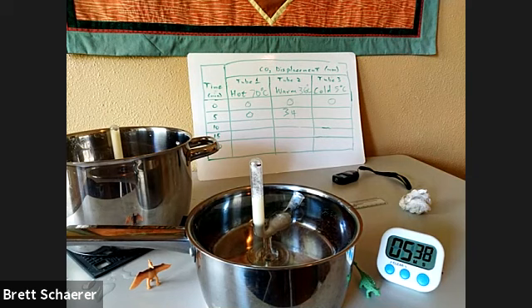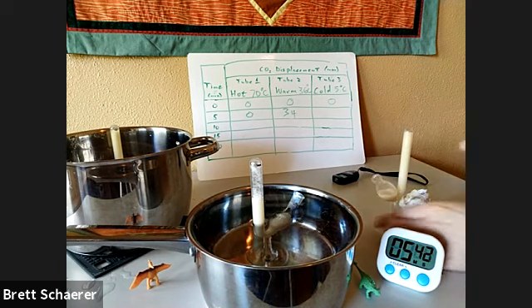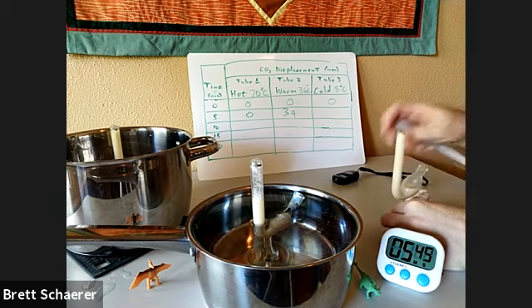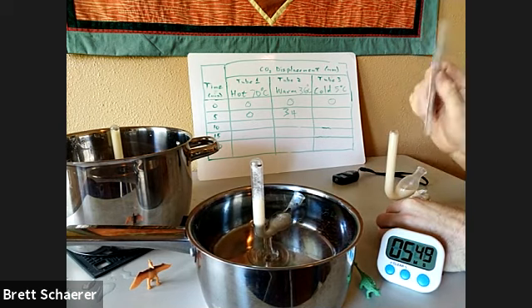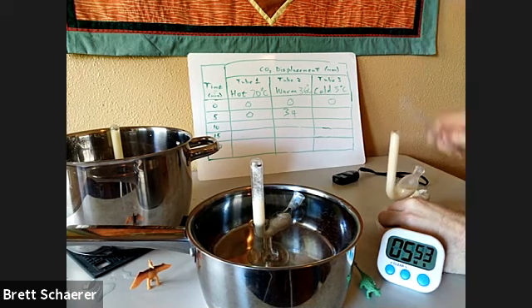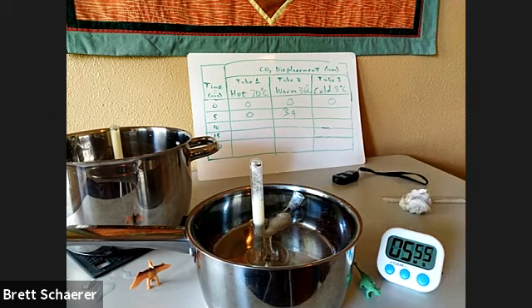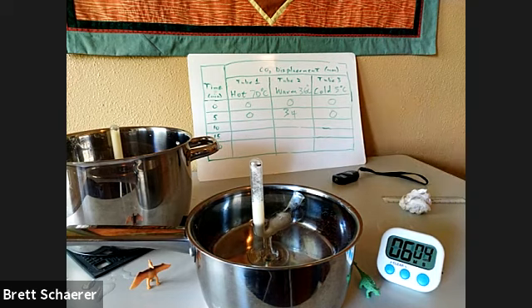Cold tube, I'll bring out of the cooler. This is also, looks like it's still at 0. Yeah. We'll let this go another 5 minutes and take some more data.